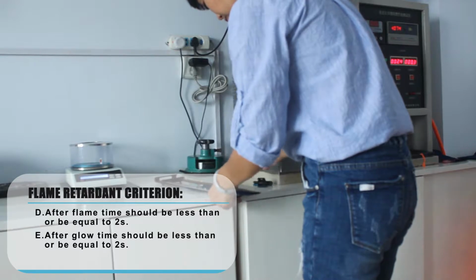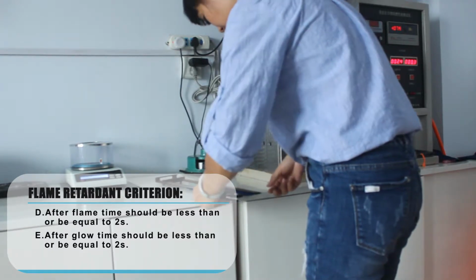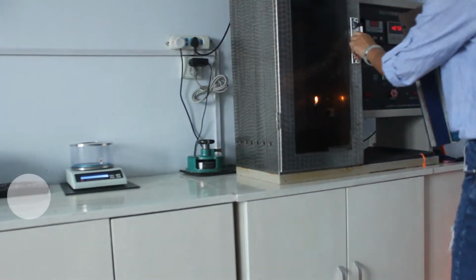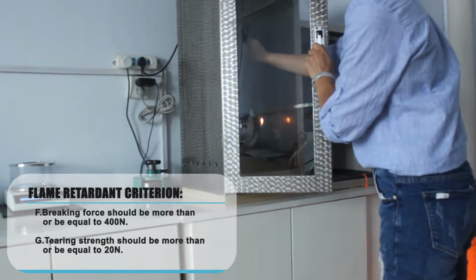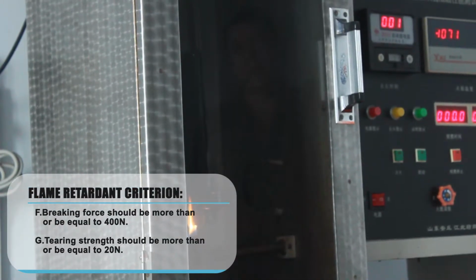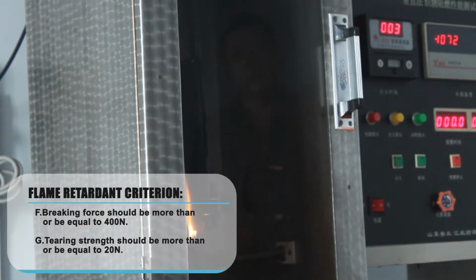the specified combustion chamber, after the fire source is taken away. Measure the after flame time and afterglow time of ignited flame retardant fabric. When the afterglow finishes, measure the damage length of flame retardant fabric according to the specified method.